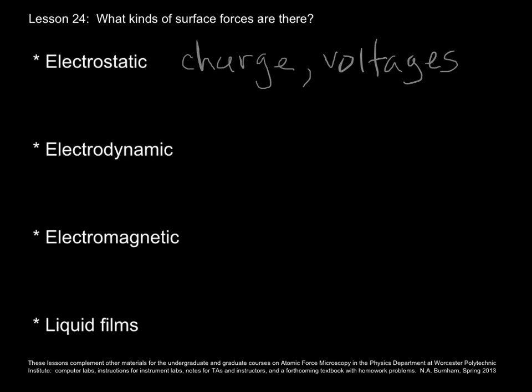By electrodynamic, I mean the fluctuating motions of electrons, and this leads to van der Waals forces. Or if you've got a liquid that has polar molecules in it, those molecules can rotate around and also give rise to changing electric fields.